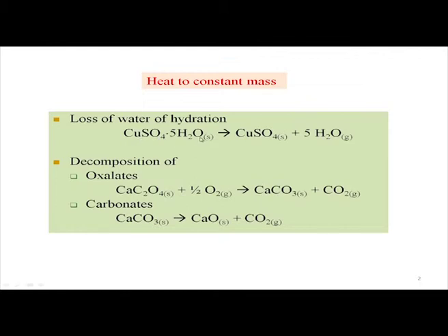So, this one will immediately show some color change for the monohydrate formation, and then monohydrate will go ultimately to the anhydrous form of copper sulphate. The temperature ranges which are known to us for the formation of monohydrate copper sulphate and the corresponding anhydrous copper sulphate are important, because some of these samples are very useful. Even in small amounts, they can show some catalytic effect in any organic transformation, any biochemical transformation, or any pharmaceutical preparations. We can use 3 different types of copper sulphate therefore.